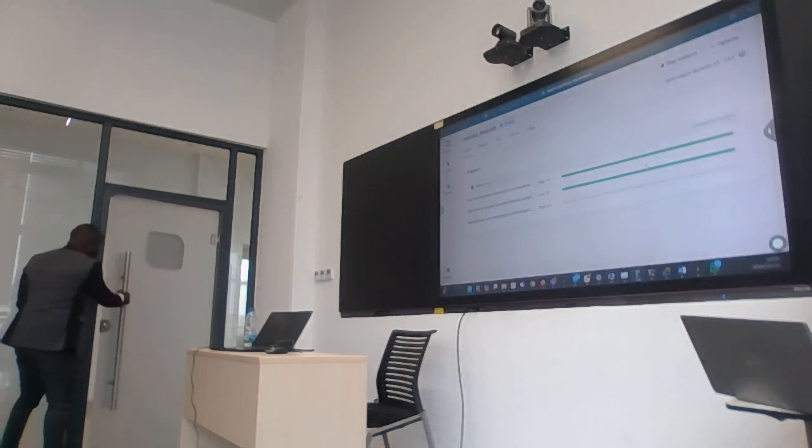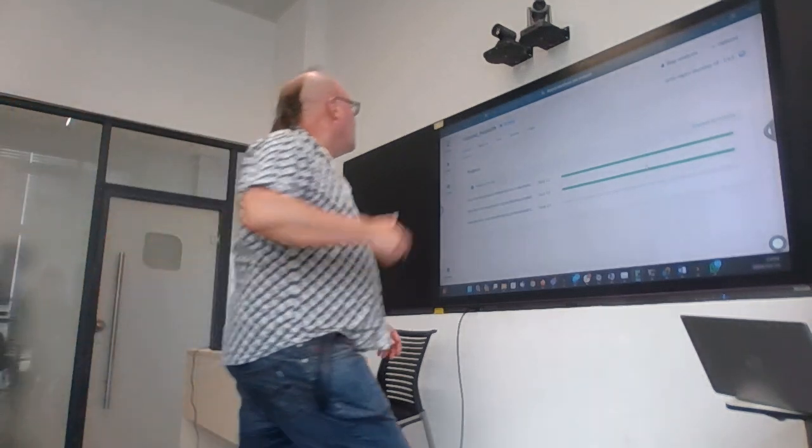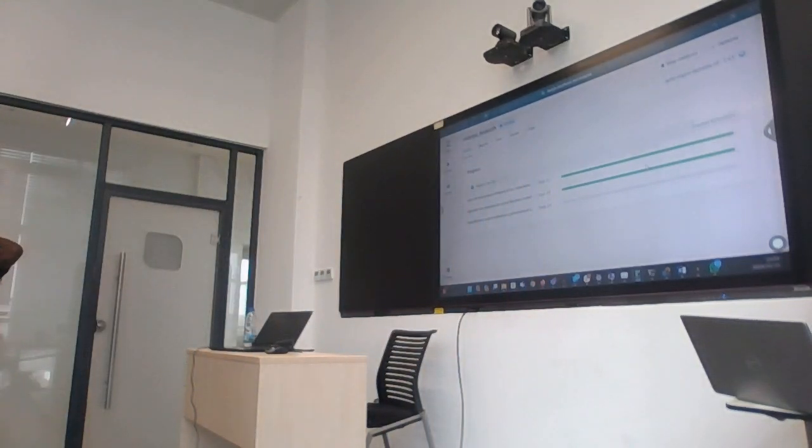Okay. Now what we're seeing here are the different steps of the workflow. The first step is indexing the reference. This is a technical thing: the reference sequence that you're comparing against. Which file format is the reference sequence? FASTA. The genome reference is in FASTA format. It makes an index so that it's quicker to search through. So that's the first step.